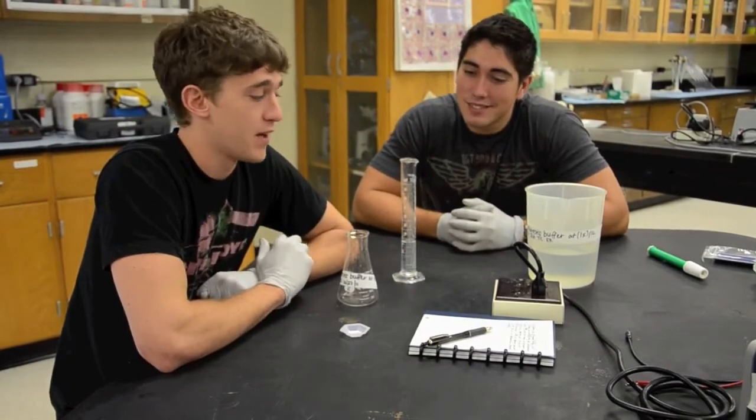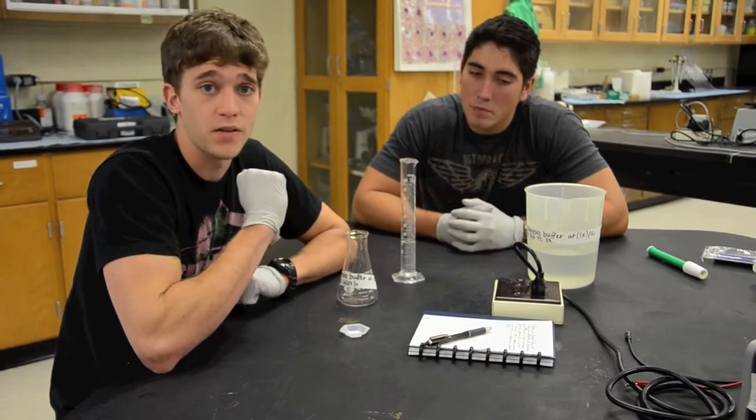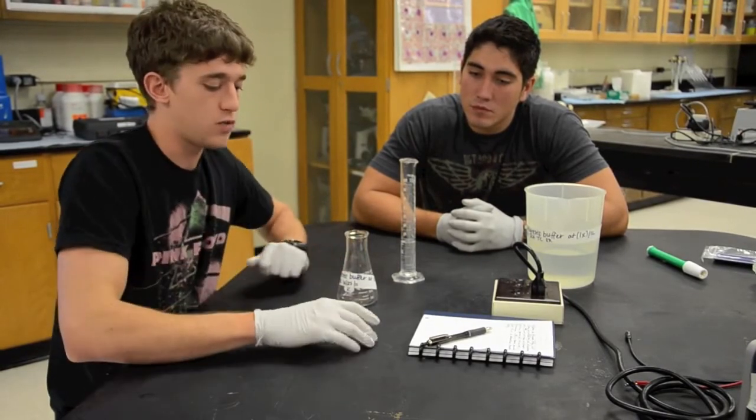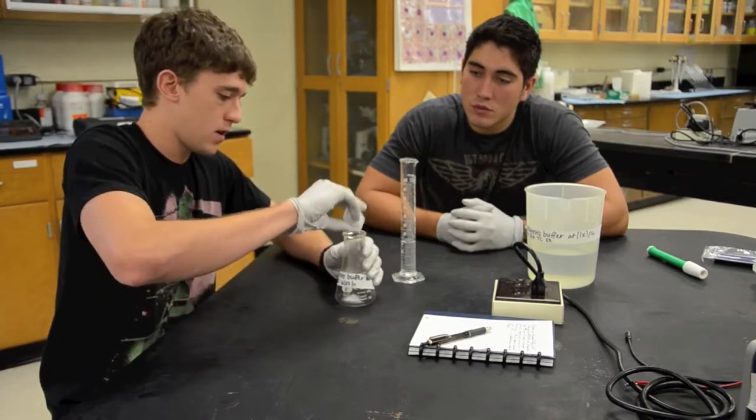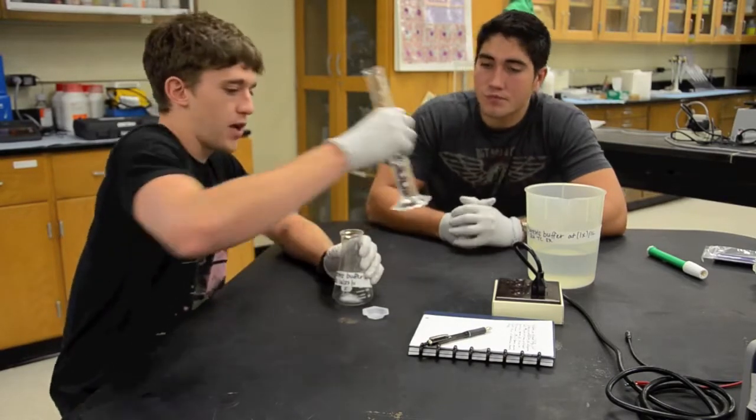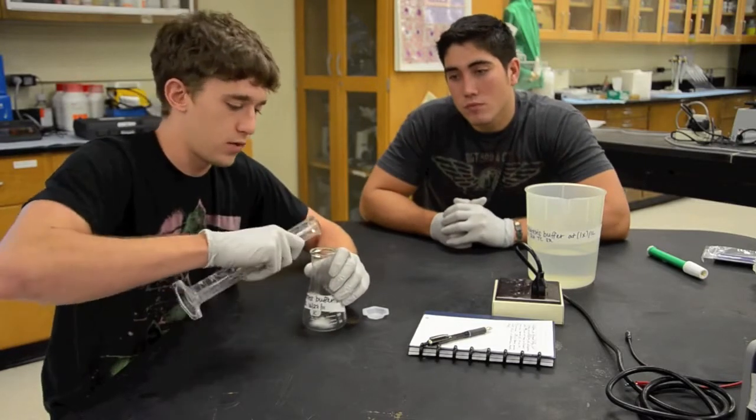Alright, welcome to lab. Today we'll be doing the electrophoresis lab. Now to do this we're going to start by mixing our agarose gel. First we're going to need to mix 0.23 grams of agarose powder with our accurately measured out 30 milliliters of electrophoresis buffer.